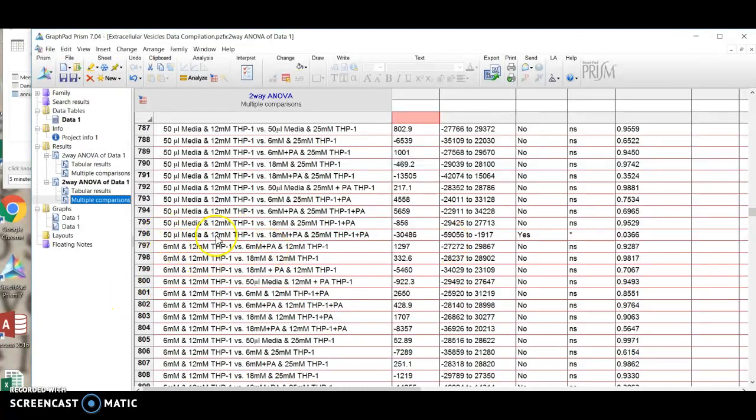So this is where we've just got plain untreated cells, essentially. I would probably call these untreated, actually, that's kind of easier to follow. And then actually when you look at the most potent, if you like, of your treatments, you can see that there's a difference at the later time points.